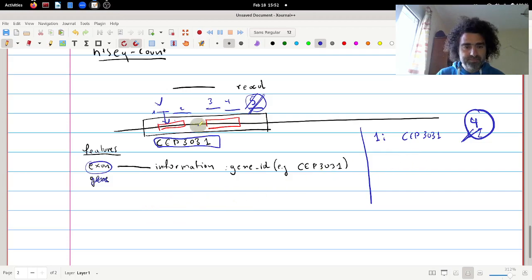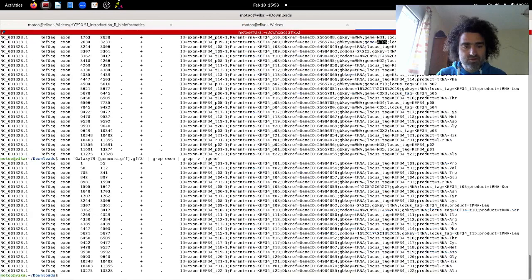So again, reads are mapped to features, but what we count from a feature is some specific information, some specific attribute. What we will do in HTSeq is map reads to exon features, but then count the gene ID attributes. And this GFF file that we have used all the time is a bit problematic because the gene ID, or transcript ID, is not present in all exon information.